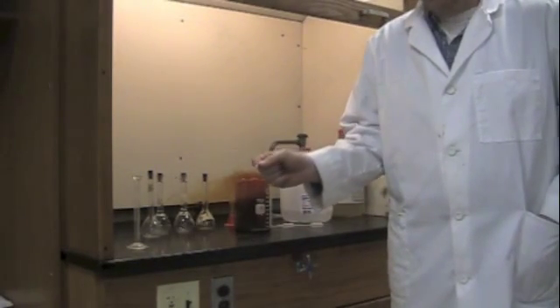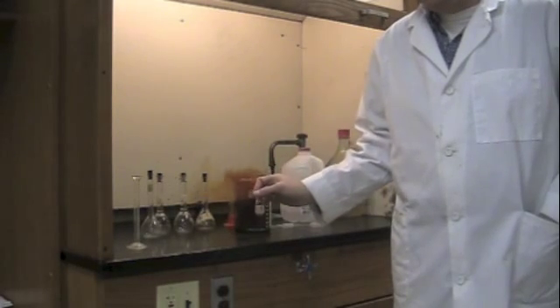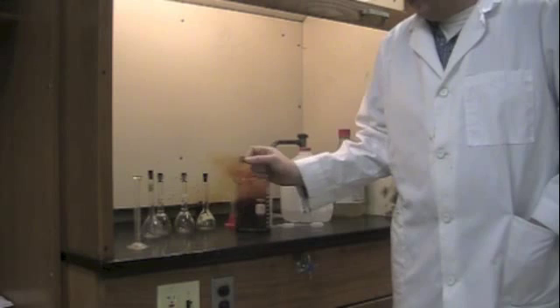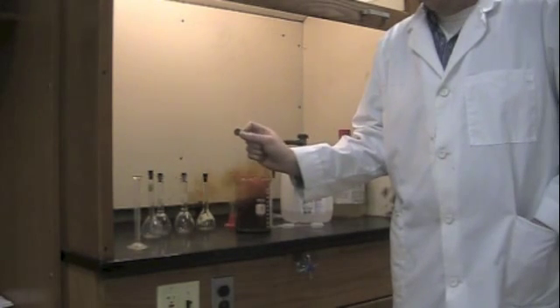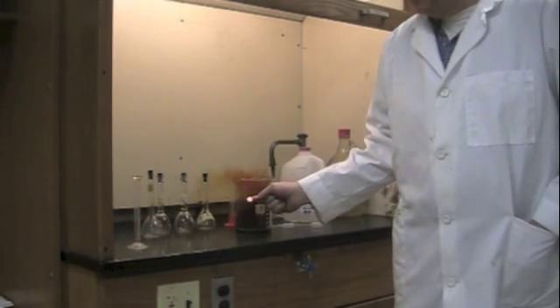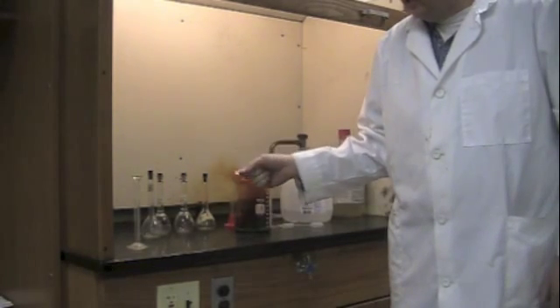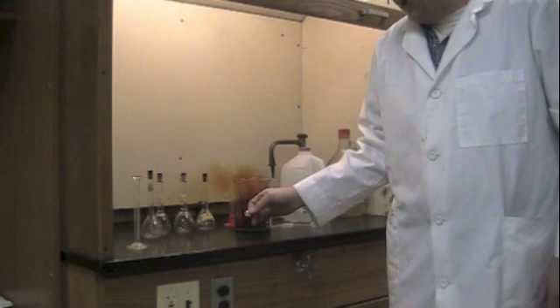Next week you will be doing the same kind of chemical reaction. Instead of putting pure copper in with the nitric acid, you will be putting a real penny in with the nitric acid and the nitric acid will react with the penny and the zinc and dissolve it all and make a solution.